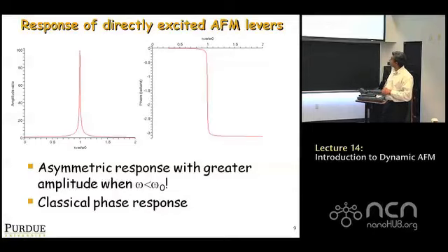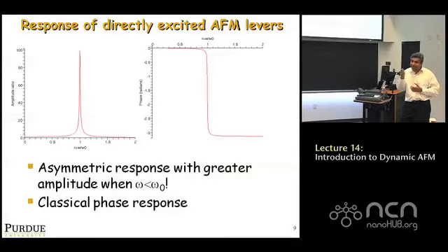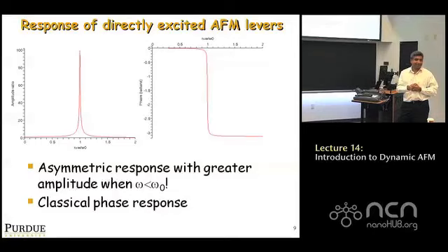So I hope you have come to appreciate now that the response really depends. Simple things like the tuning curve are telling you many different things. With the tuning curve, if you do it properly, if you do acoustic excitation, you can actually measure the amount that the piezo is shaking up and down. I really encourage you to do that, because it gives you a very physical feeling, because these are very small things. At the end of the day, you really don't know what's going on in the system.